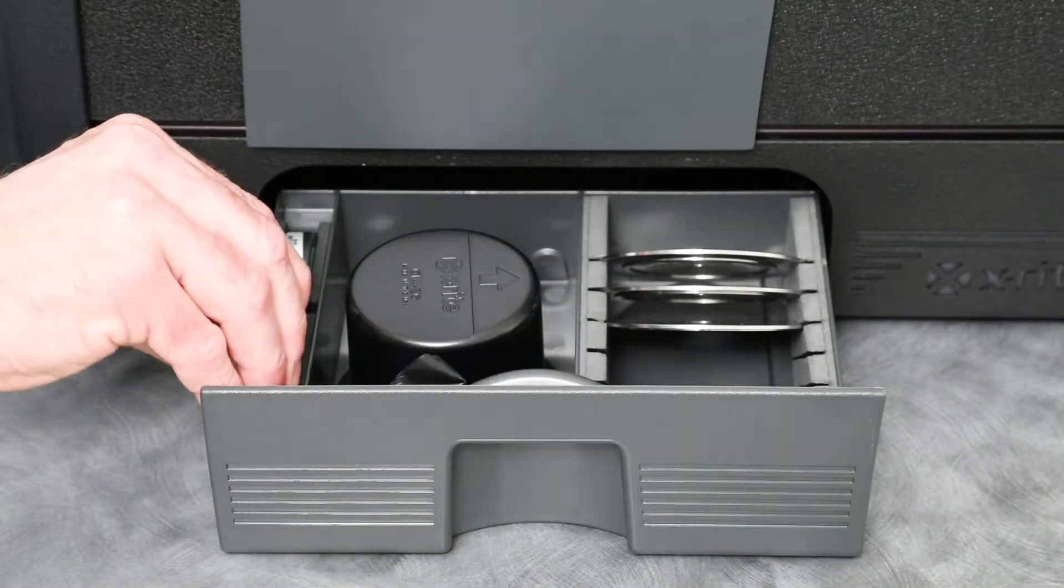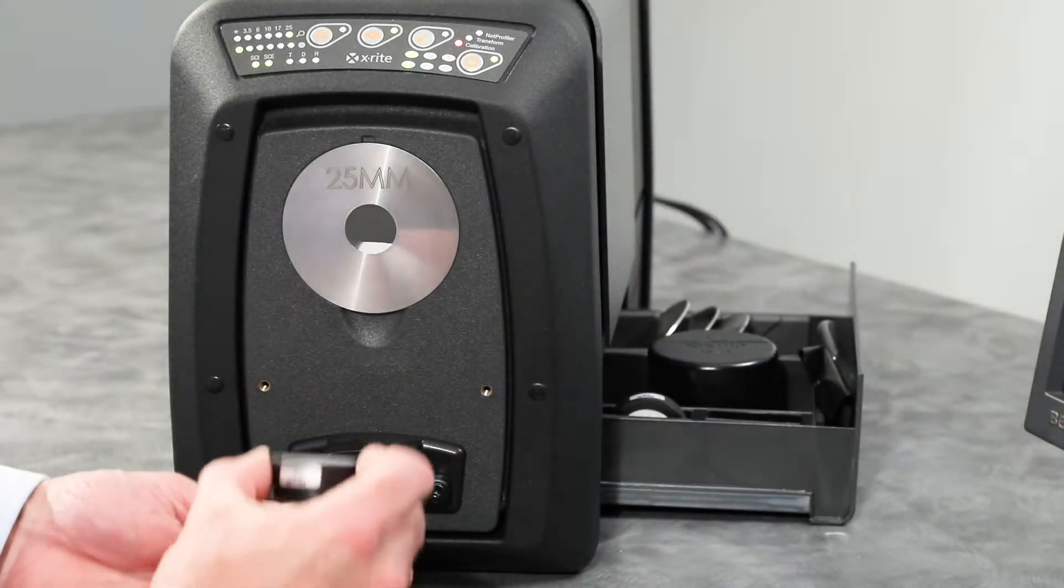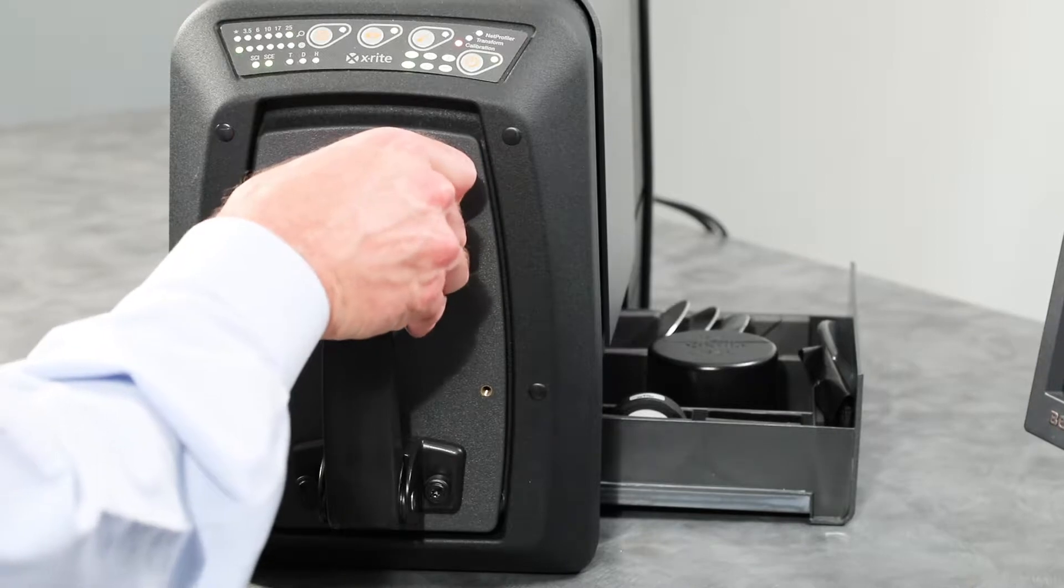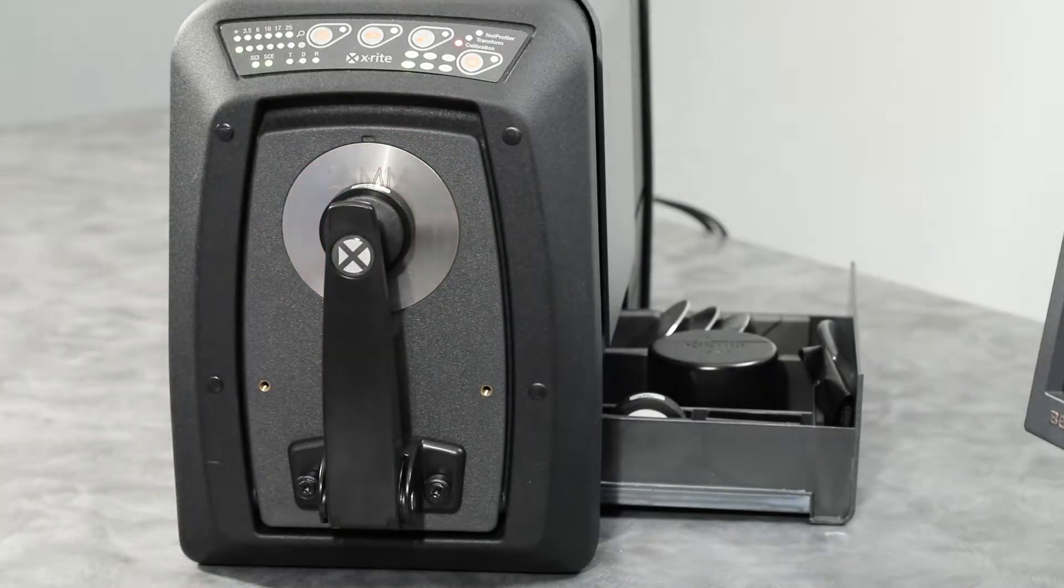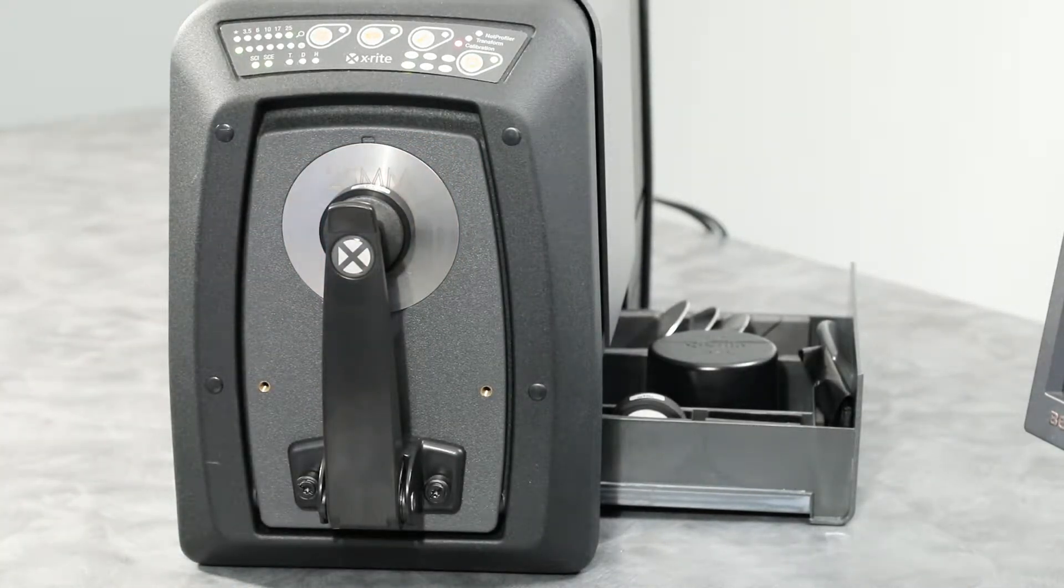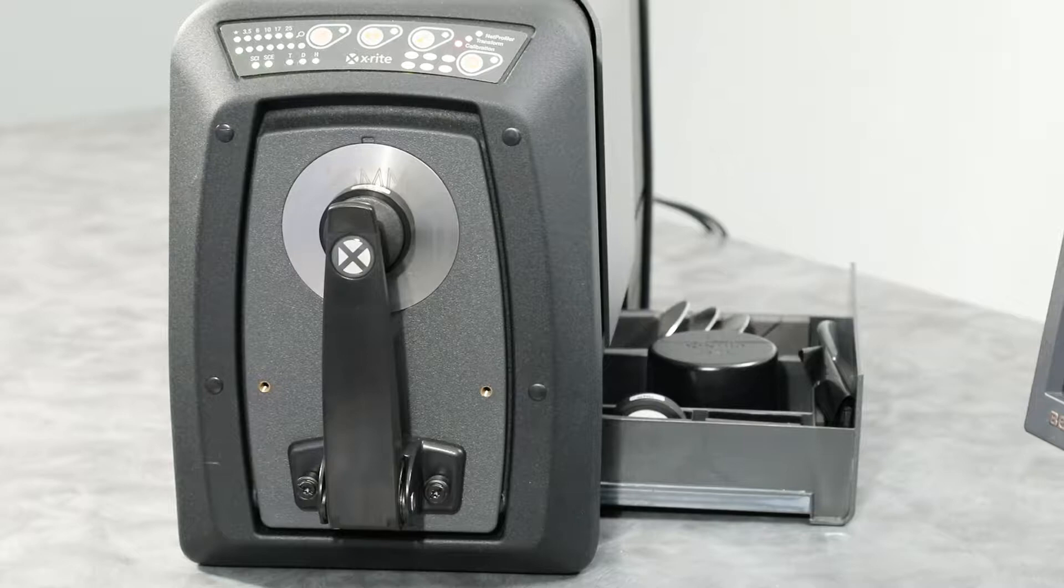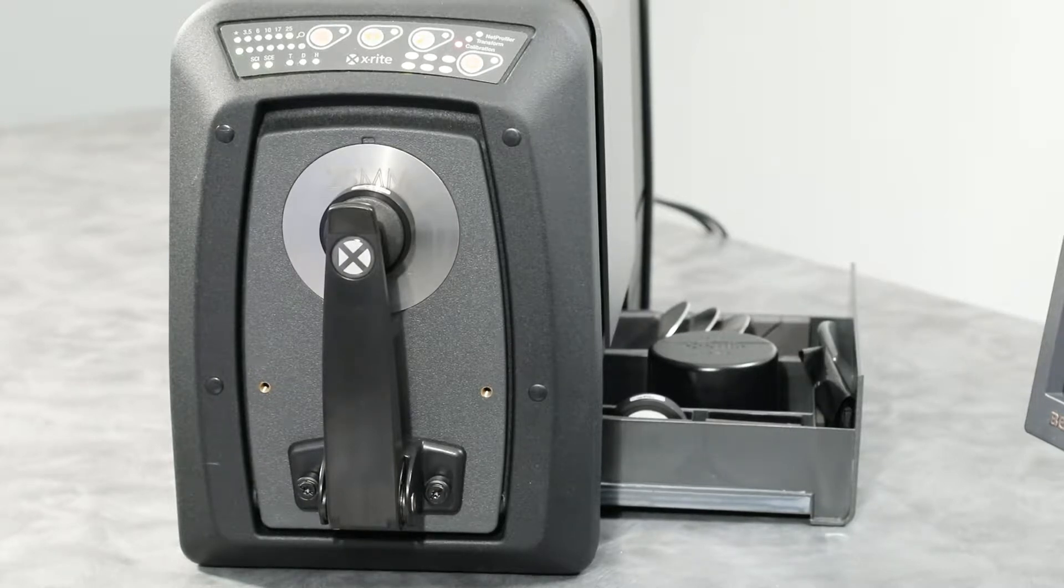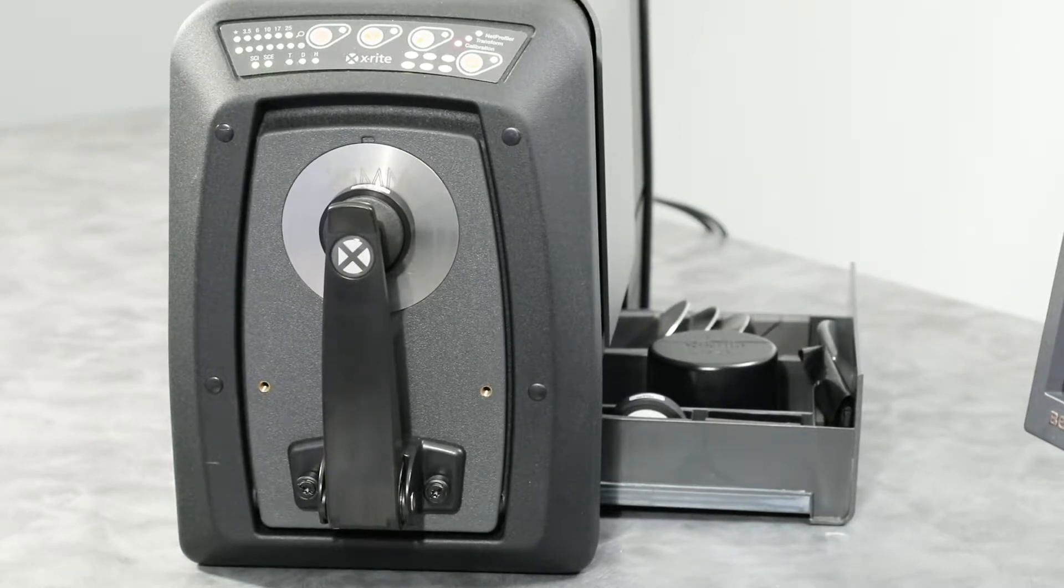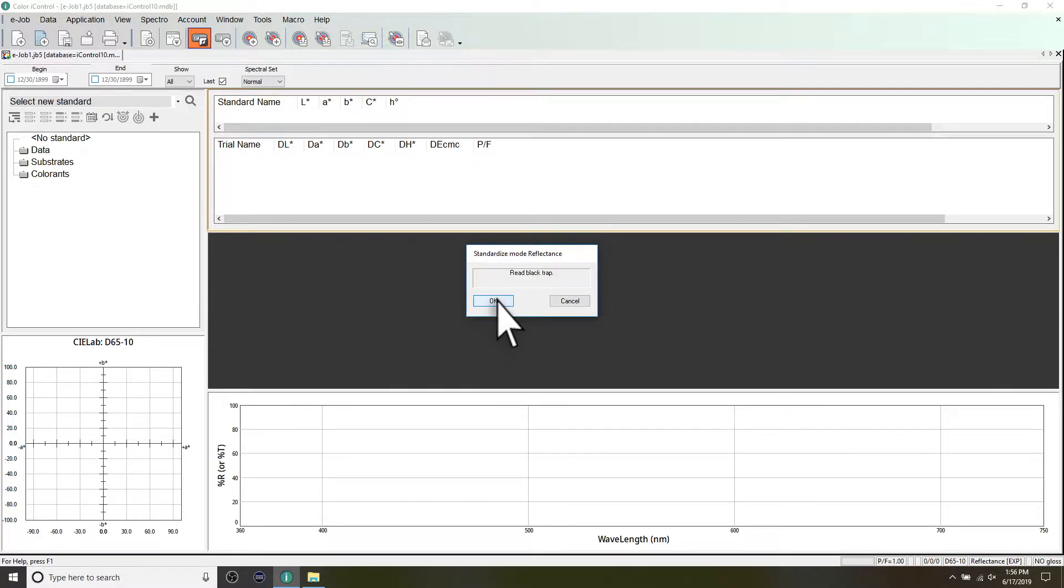Remove the white calibration tile from the accessory drawer and position it on the sample holder so that the white ceramic side is facing the aperture plate. The white tile's serial number should always be on top to ensure repeatability. Initiate the measurement from your software. After the measurement is complete, return the tile to your accessory drawer.